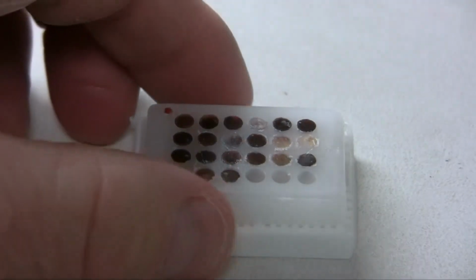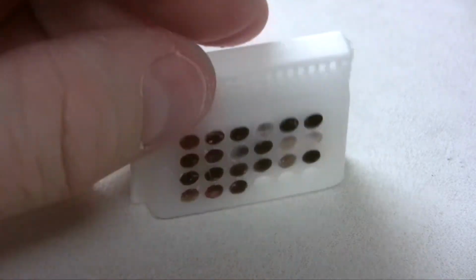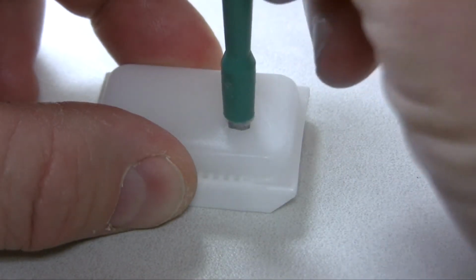The best way to flatten your cores and make them even is to flip the block over and press it gently on a countertop. To fill the empty holes left in the TMA, use the same paraffin that was used to construct the TMA. I often create blank paraffin blocks to use as fillers for my TMAs.